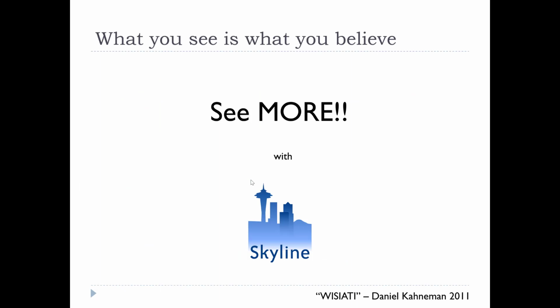So, a big principle of Skyline: I was telling Brian recently that my early software days were working at Microsoft on development tools, on an environment for developing software, and very much involved with a debugger. And I feel like Skyline is a little bit of a data debugging tool and a data understanding tool. We focus a lot on how quickly you can understand your data and how you can understand your data more, because we make mistakes all the time.